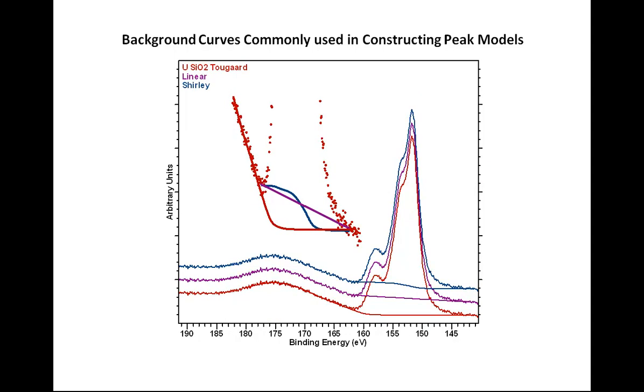The curves we use for backgrounds tend to be more limited in number, but nevertheless are quite complex in their calculation for a given set of data.